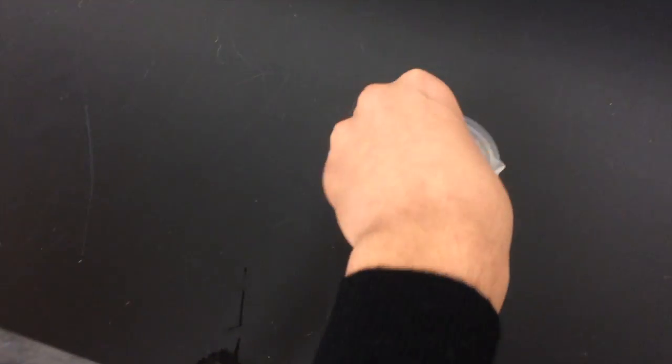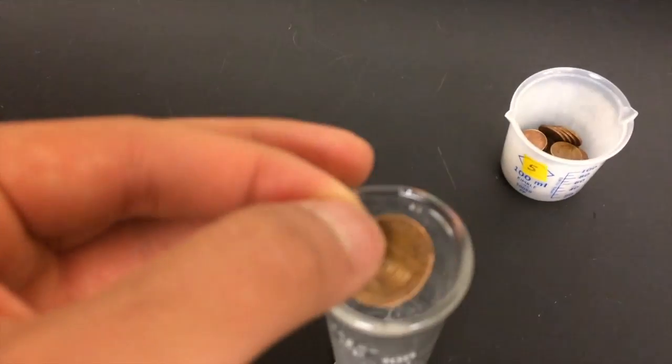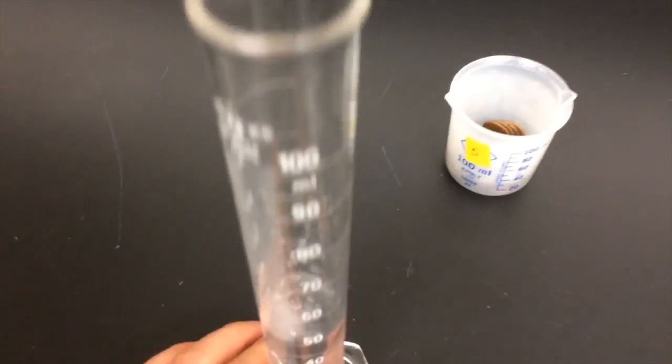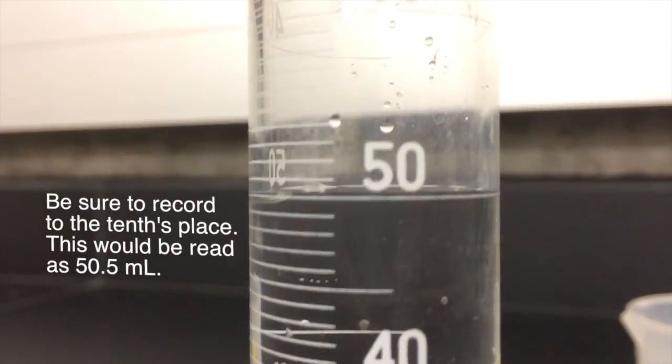To record the volume, go ahead and use a 100 milliliter graduated cylinder, that way your pennies don't get stuck inside the cylinder while they're going down. And to start, go ahead and record your initial volume, and we've marked the meniscus there with an arrow.